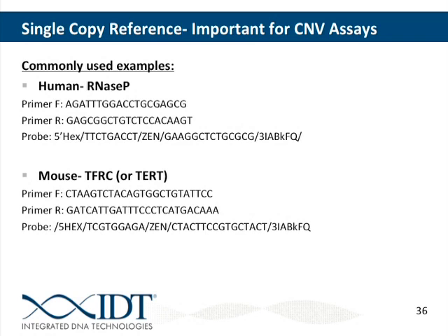Sometimes with multiplexing, you need to take and optimize each individual reaction separately. So if you throw everything together and have some issues at first, you can take them separately and optimize by Tm gradient or whatnot to optimize each reaction. And there are some considerations for multiplexing, as Arita mentioned earlier, but taking all of that into account, there's an excellent chance that they would both work.